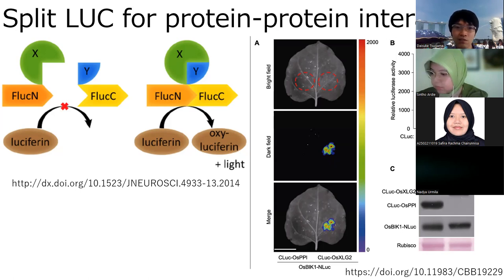I mean, if we want to directly detect protein X and protein Y, we need to prepare two kinds of antibody specific to those two proteins. And raising antibody can take time and cost. So if we use tags, we can just buy commercial antibodies for those tags and reporters. Because those reporters and tags are often used, commercial antibodies are often available for them. And it can be cheaper and more useful for doing Western blotting.